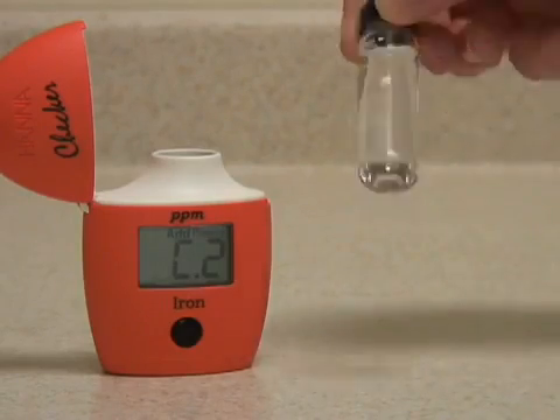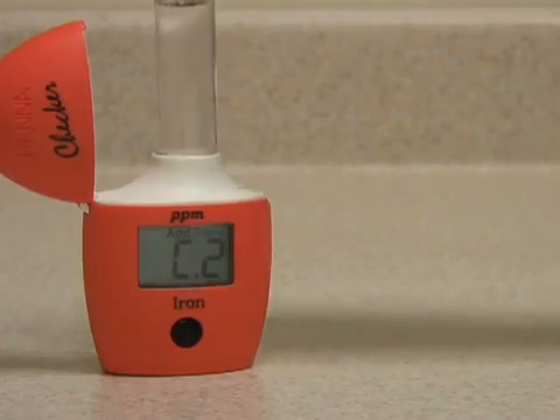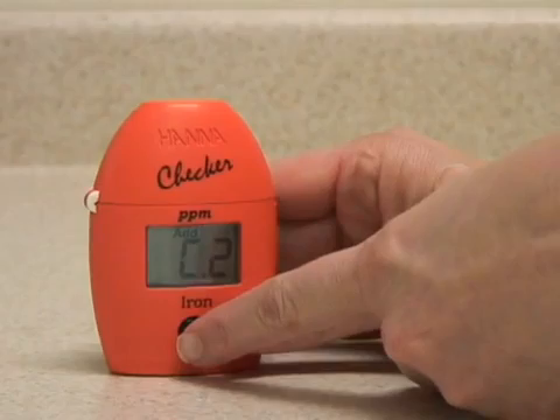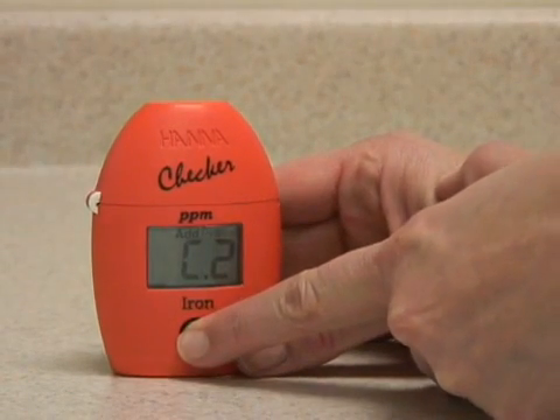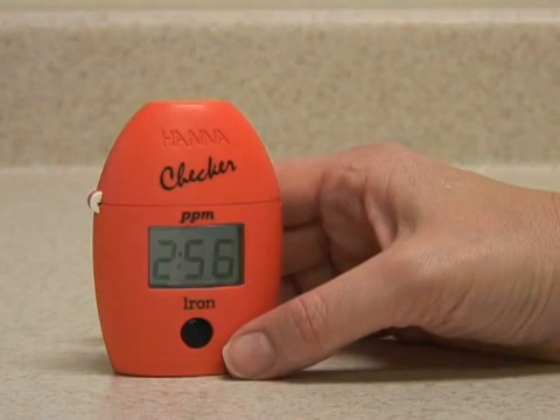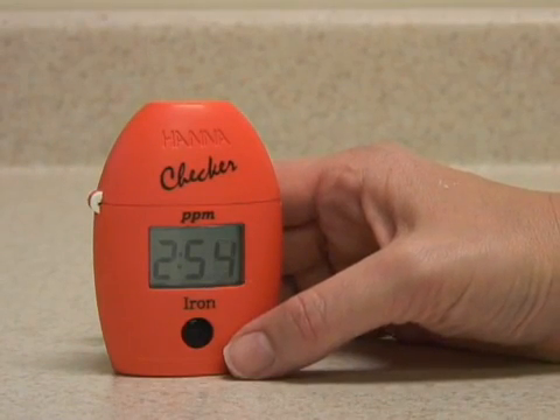When the reagent is dissolved, replace the vial in the meter, close the cap, and press and hold the button to activate the read timed function. The meter will now count down the three-minute reaction time and then analyze the sample.